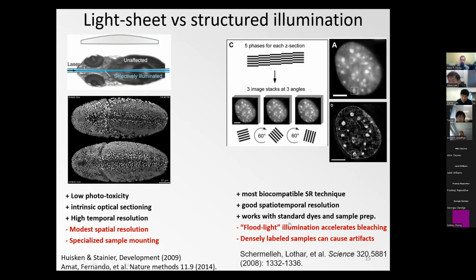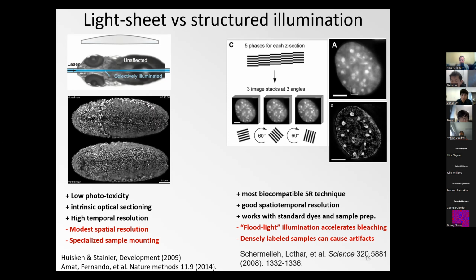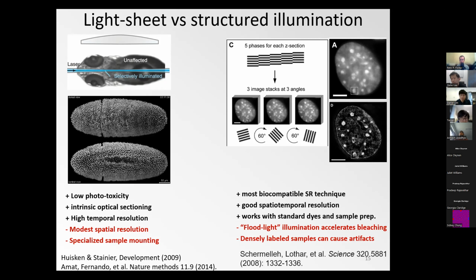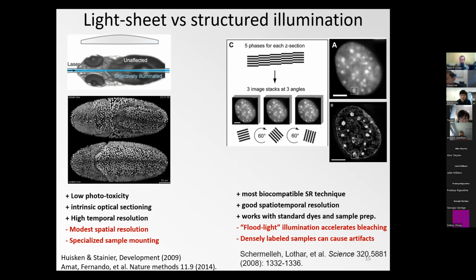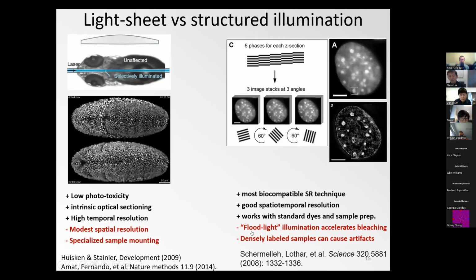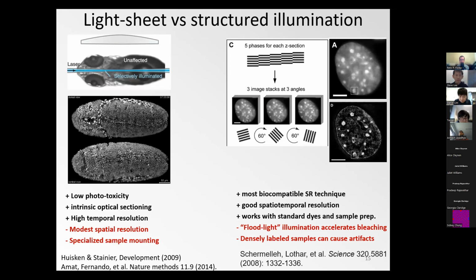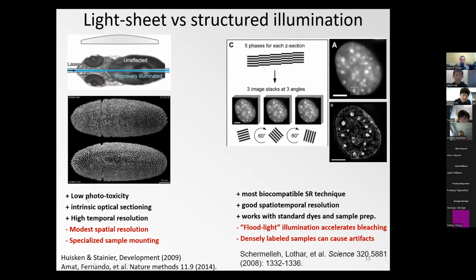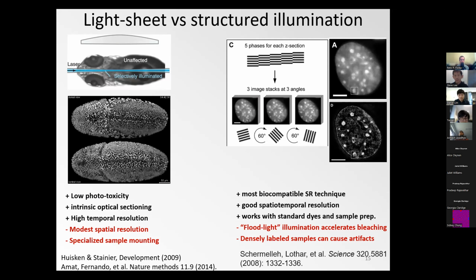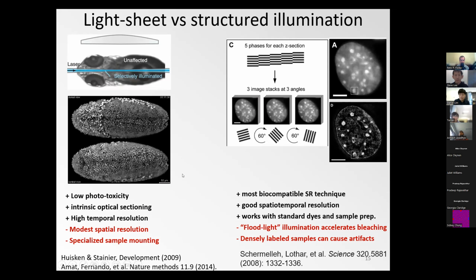But in its nature, if you image a 3D sample, it essentially illuminates everything. So what we said before, what we actually don't want for the photon budget, because we excite fluorophores above and below the focal plane. So we essentially waste those excitations. And if the sample is very densely labeled, this kind of floodlighting of the sample also leads to a lot of blur, which can then also lead to artifacts. So if we could combine the positives of the two techniques, then we could have a gentle 3D microscope that would also have a doubled resolution compared to what the Lightsheet can do.